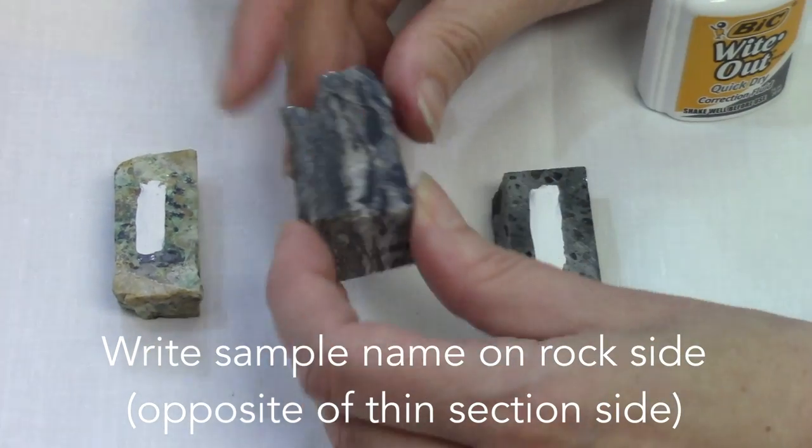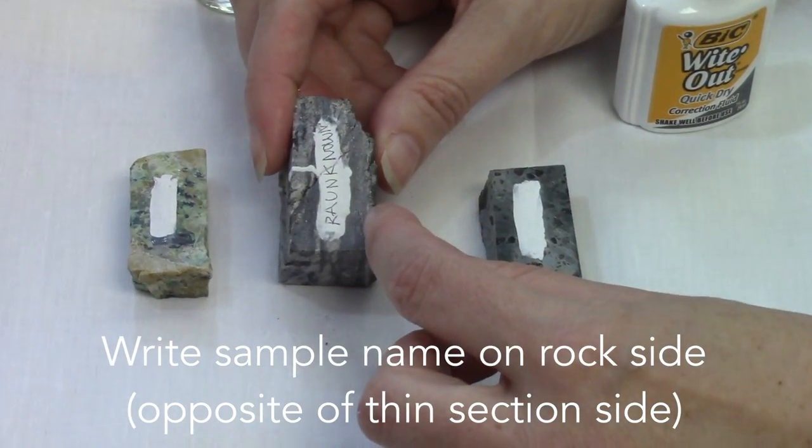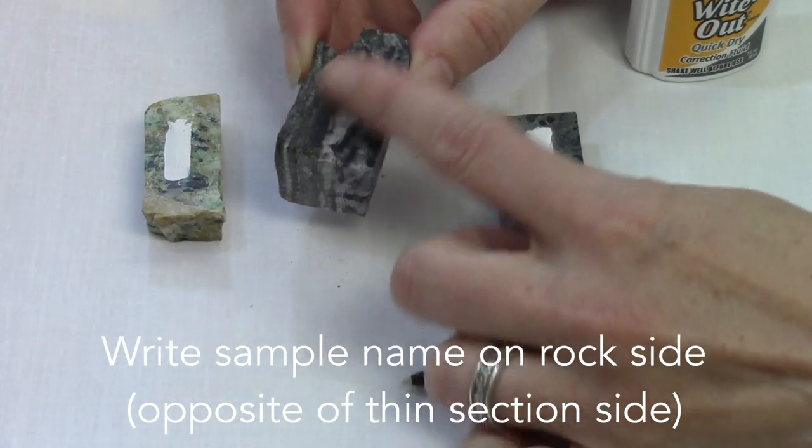It's always useful to label the thin sections on the side opposite to where you want to make the thin section.